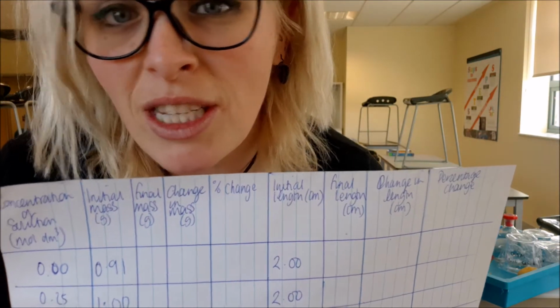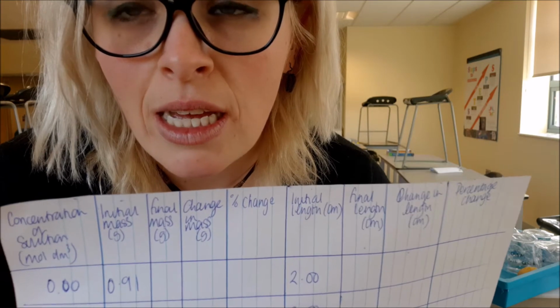I'm going to put in my concentrations, and I'm going to leave them for about 20 minutes at least. Now, when we're doing this, if you have to give a method, always give times. So I'm going to say 20 minutes, because that's how much you probably would get in a lesson by the time you faffed around taking all these measurements. Not faffing, analysing.